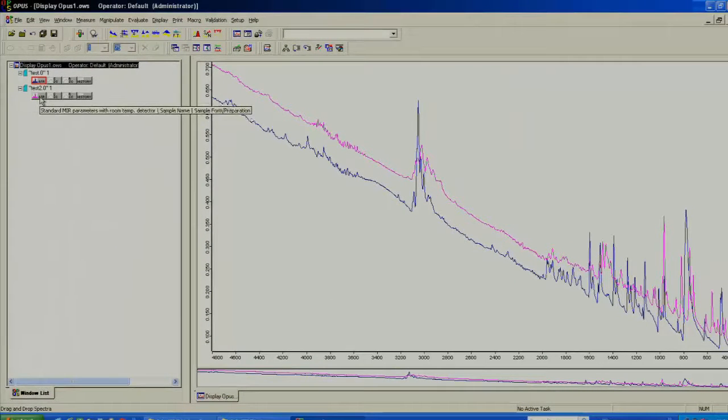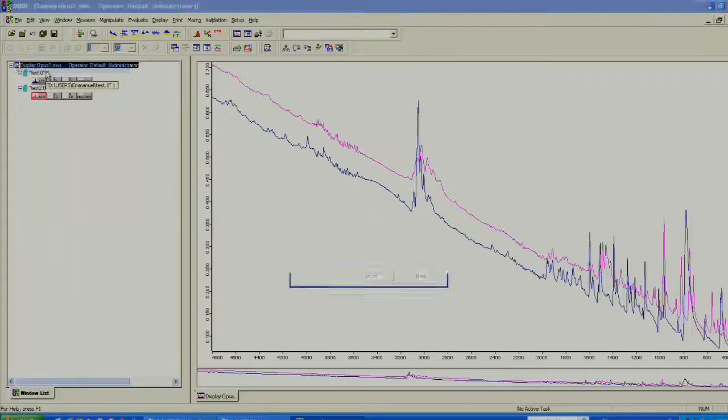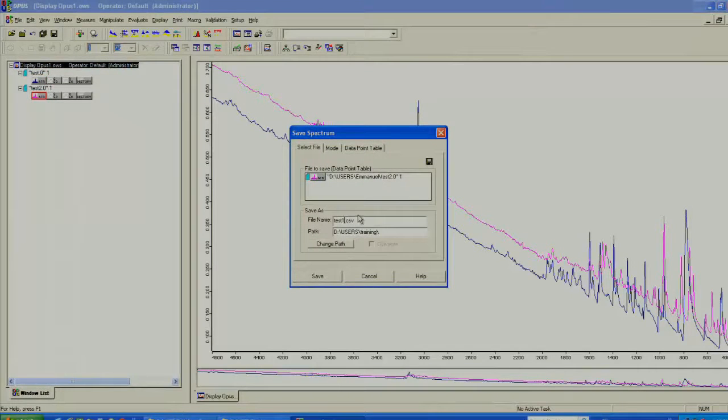You can do the same process when saving your other samples, but you only need to change the name. Your other changes will be remembered.